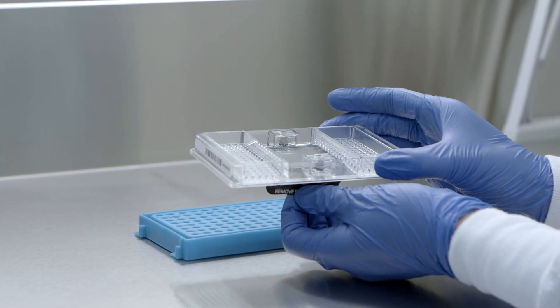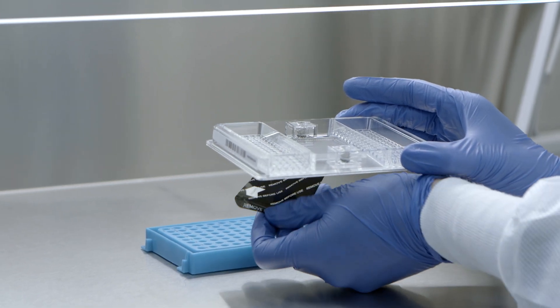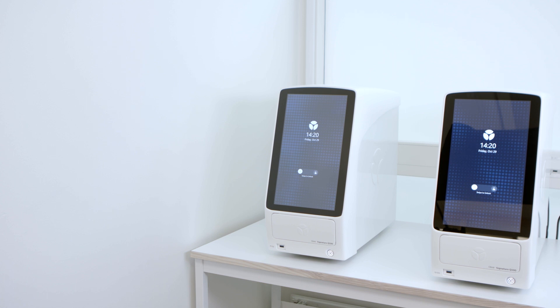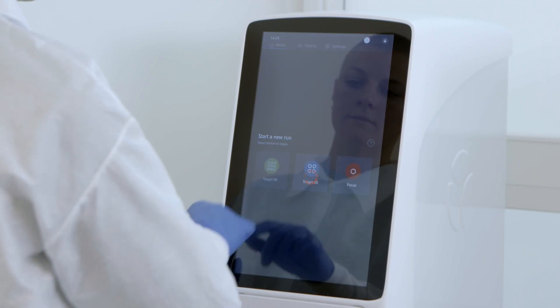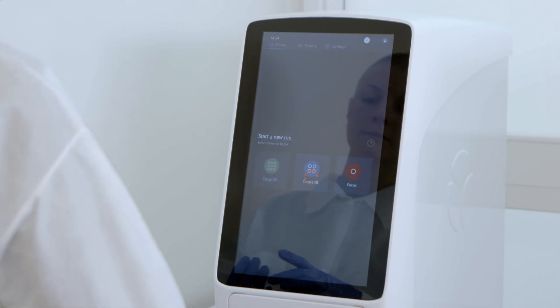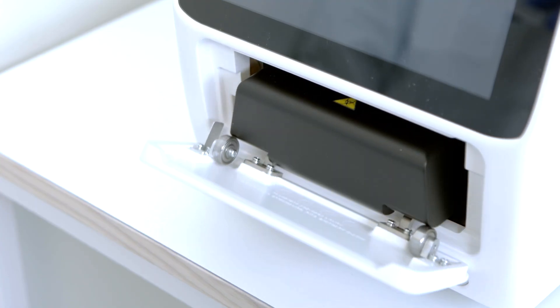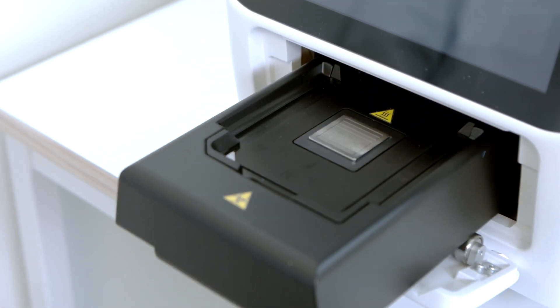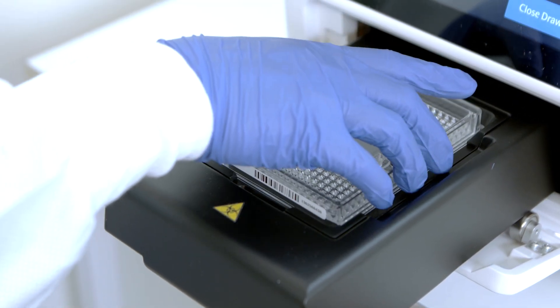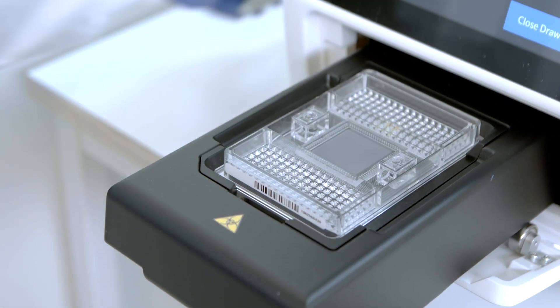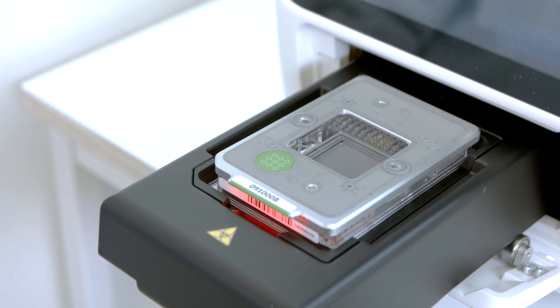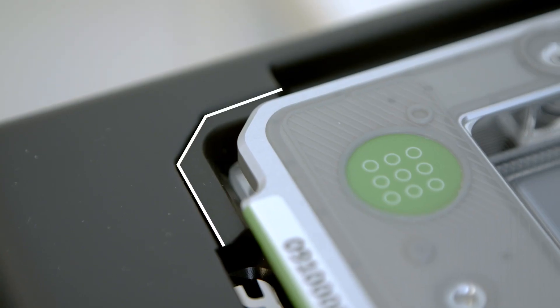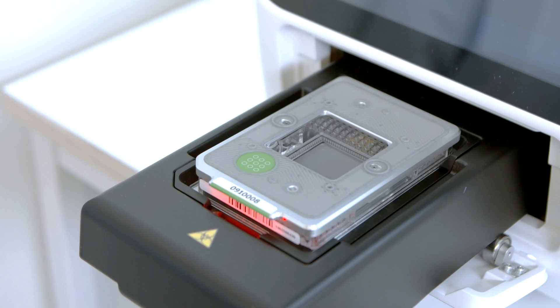Pull the protective film down and away from the bottom of the chip and discard. Now it is time for the IFC preparation step in the signature instrument. The signature instrument has a touch screen. On the start a new run screen select the target 96 script. The shuttle drawer will now open and the insert the chip containing control line fluid screen will be displayed. Carefully place the IFC containing control line fluid and the target 96 specific interface plate in the drawer. Align the notched corner of the chip to the notch on the shuttle drawer and face the barcoded edges of the chip and the interface plate forward.